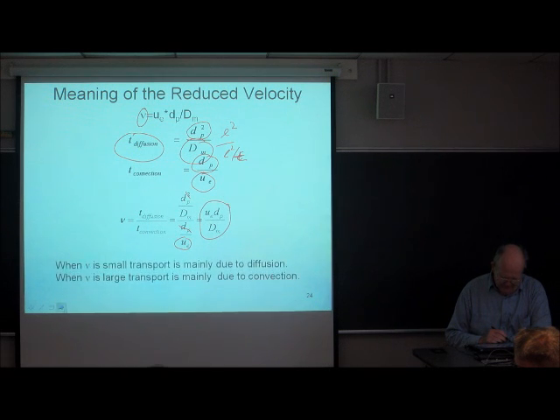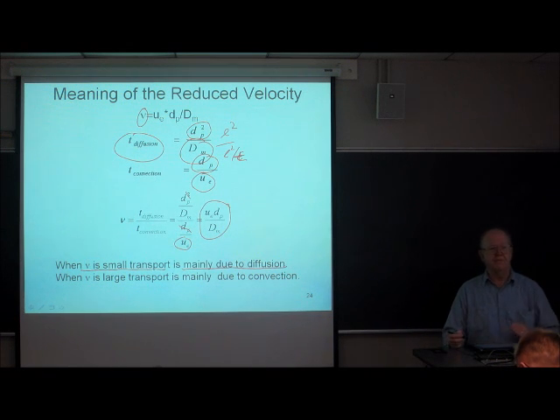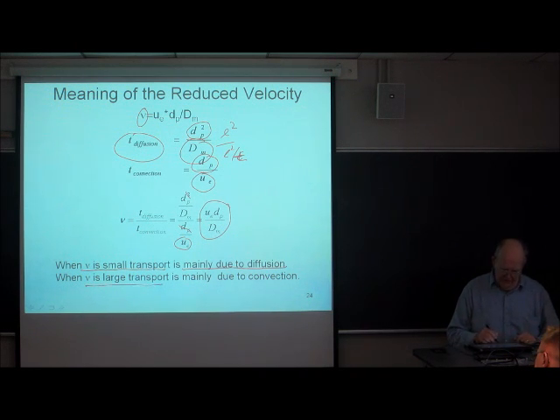So, when nu is small, transport is mainly due to diffusion. In other words, transport is controlled by diffusion. When nu is large, transport is controlled by convection.